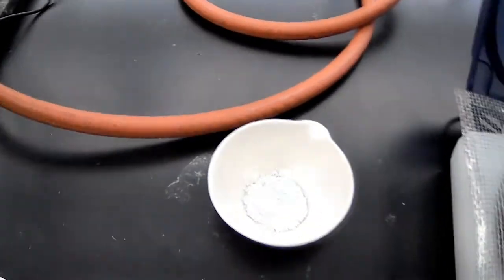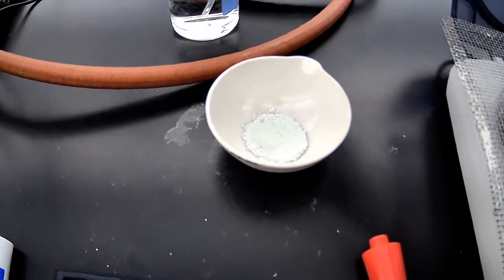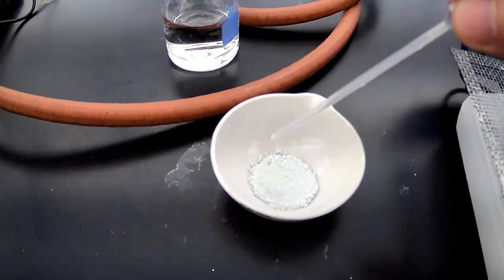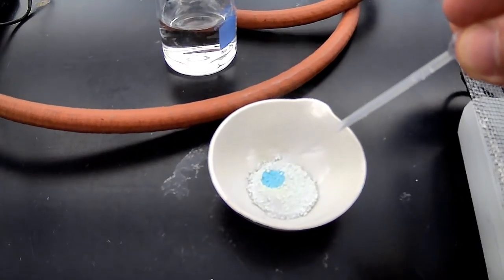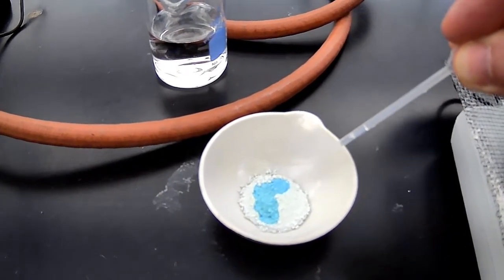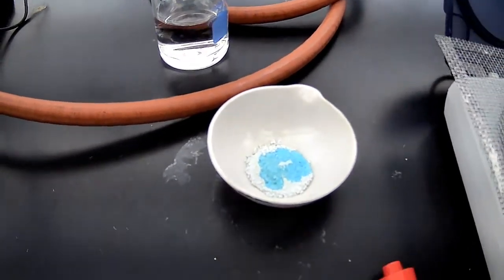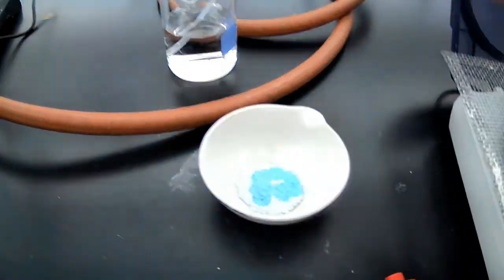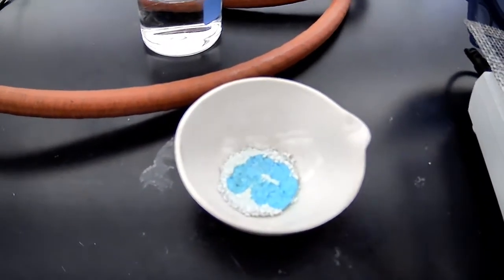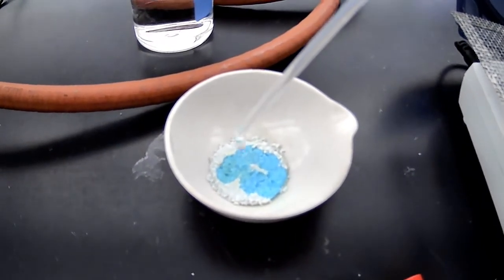Anyway, I did want to show you what happens. This is some copper 2 sulfate anhydrous that has been cooled down. So I'm just going to drop water on it, and... you saw, it sounded like it sizzled, which is kind of neat. This is not hot. It's been sitting on the counter for several hours.